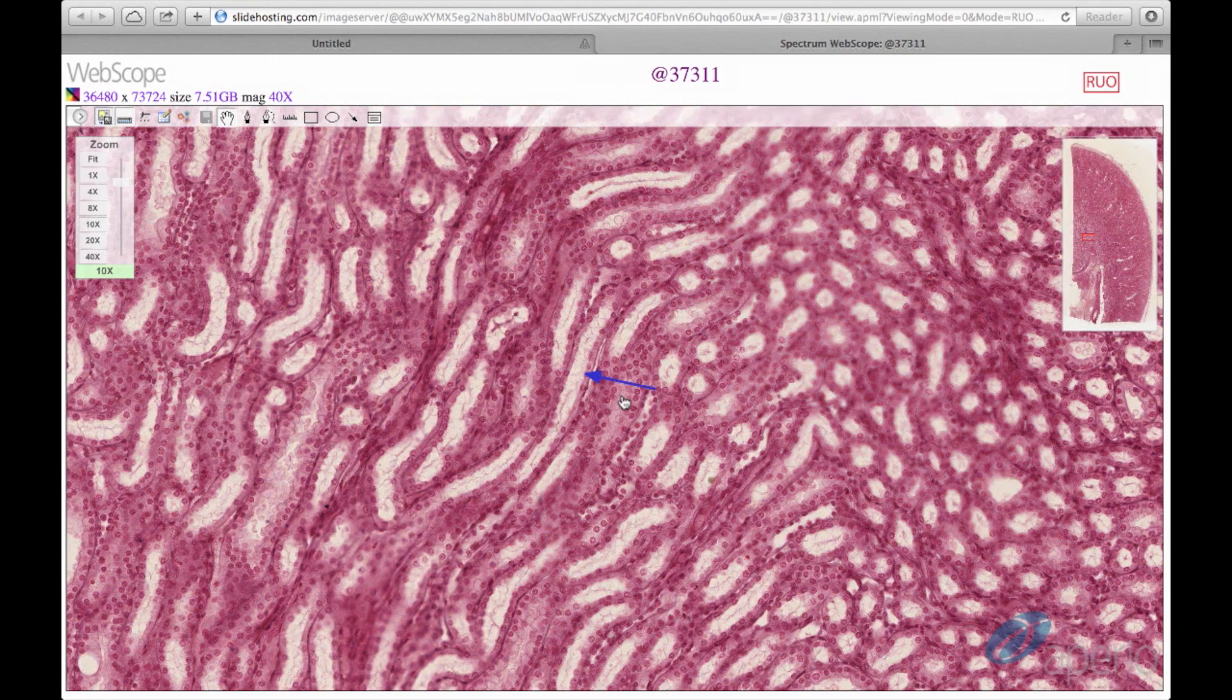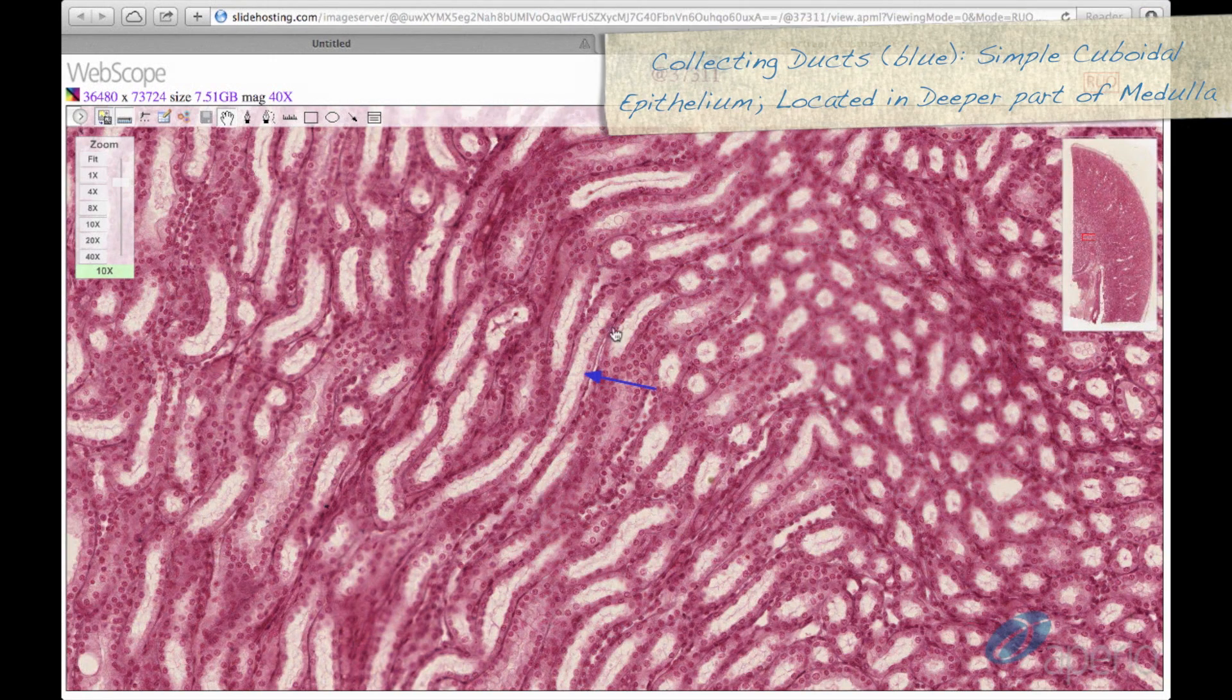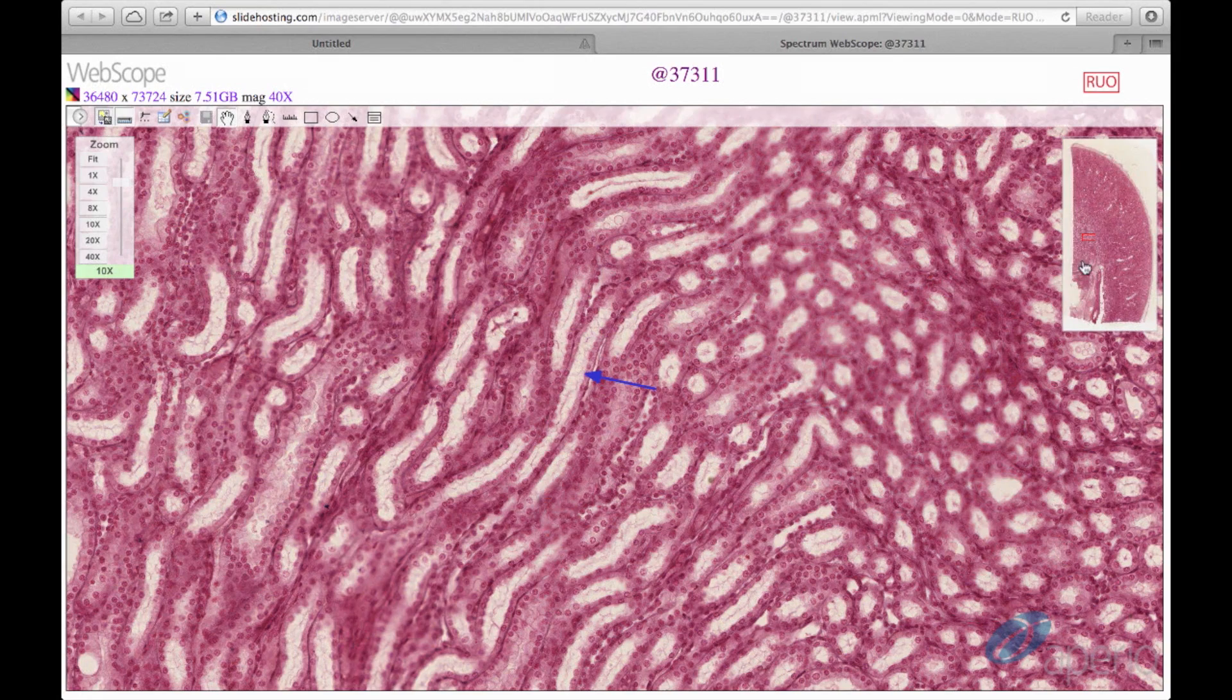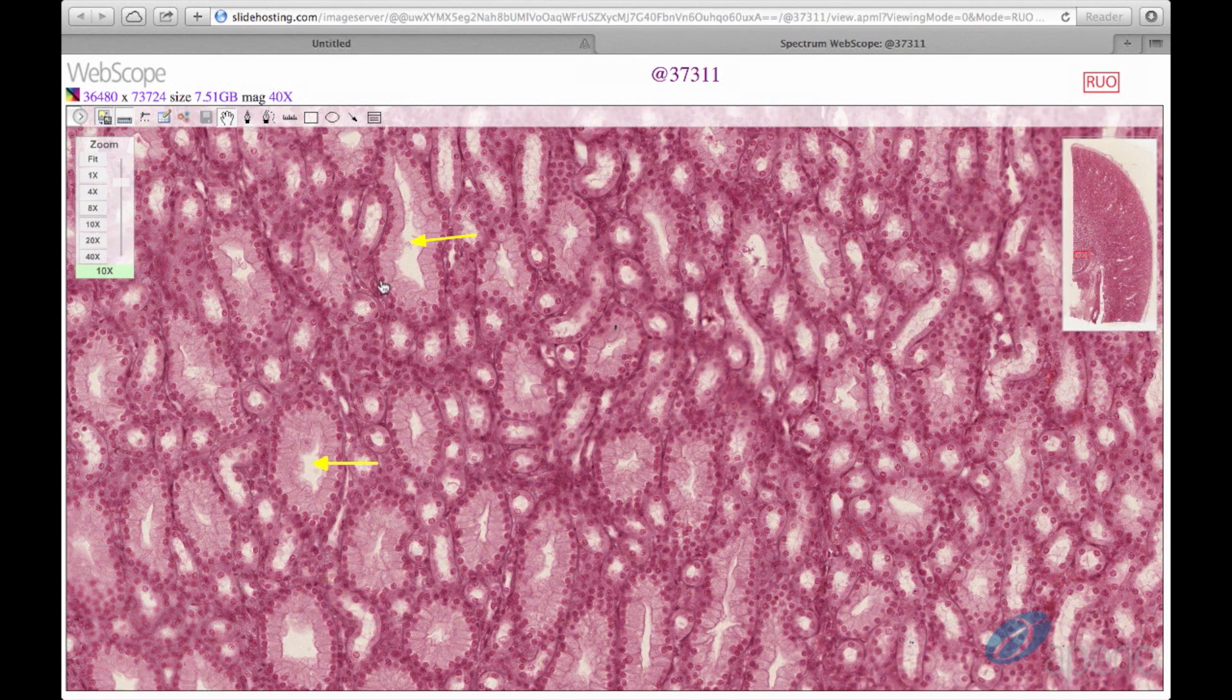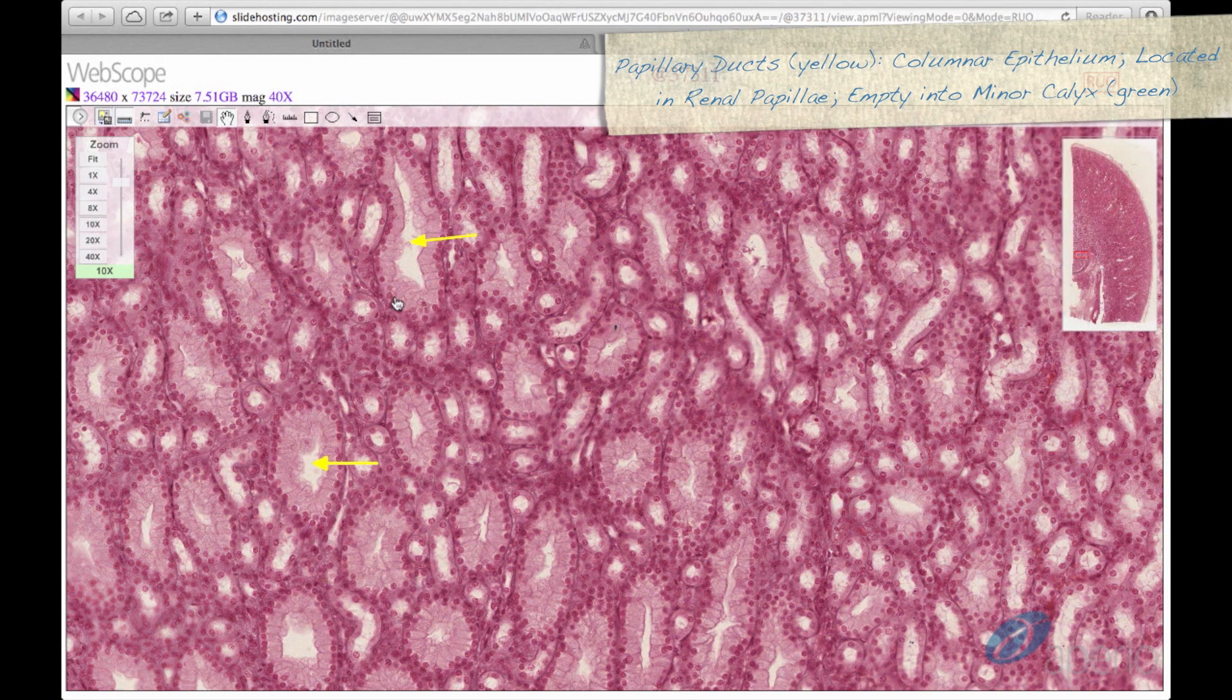Further down in the medulla, we can find the collecting ducts of the nephron here at the blue arrow. These will have a simple cuboidal epithelium as well. As we move further down, we can see a transition into a columnar epithelium, which demarcates a shift into the papillary ducts, seen here at the yellow arrow. Papillary ducts are located within the renal papilla.